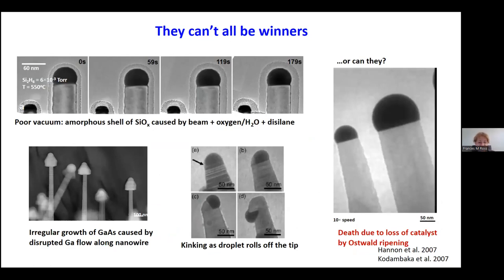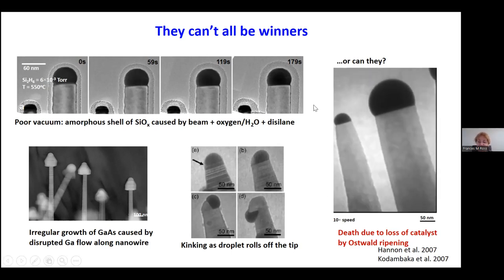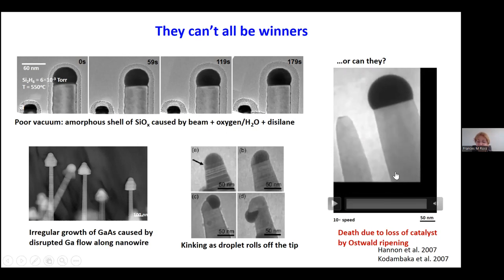I don't want to give the impression that everything works first time, because most of the time it fails for some reason. For example, if the vacuum in the microscope isn't clean, you get silicon dioxide caused by the disilane reacting with oxygen in the background, which will completely cut off the growth process. The vacuum is important. You can get irregular growth, kinking, and changes in the catalytic droplet size resulting in the death of the nanowires. Here we have Ostwald ripening — gold diffusing away down the length of the nanowire and up to the droplet in neighboring nanowires. But this gives us a lot of information about surface mobility and the physical phenomena that control growth. This turned out to be one of our most productive failures.